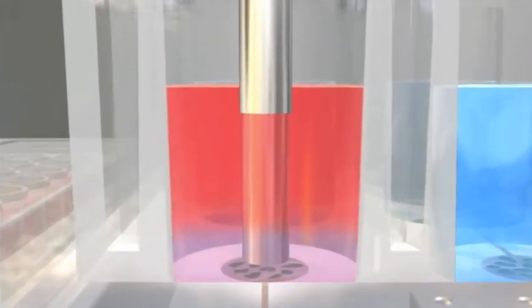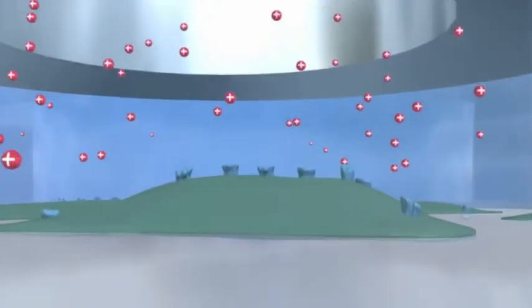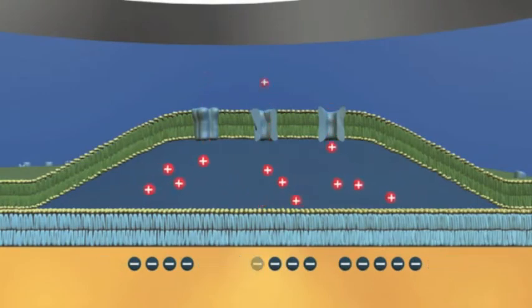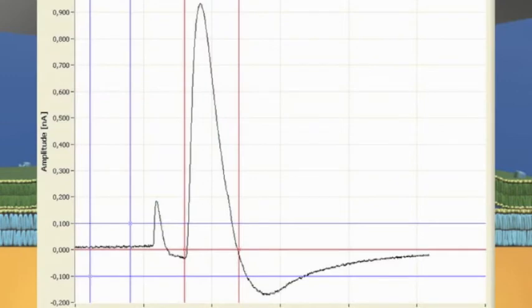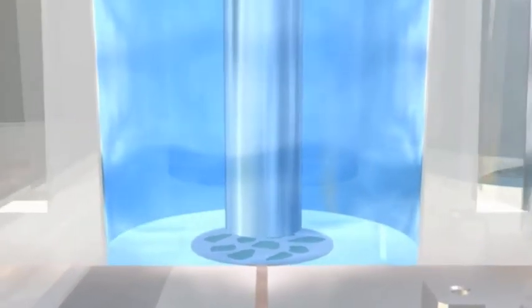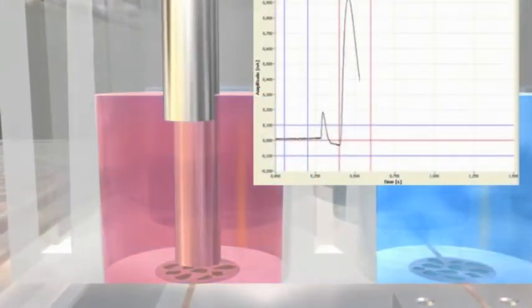Subsequently, the sensors are rinsed with non-activation solution to recover the system. Substrate clearance over the membrane leads to a backflow of the ionic substrates. An opposite directed current is detectable, indicating the de-charging of the system. Immediately after reaching the initial state, a new cycle of activation can be started. The robustness of the system allows multiple measurements on the same sensor, ensuring high data quality and low cost per data point.